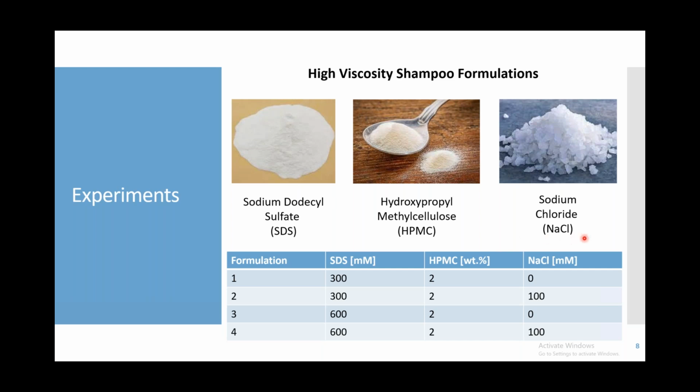The third ingredient shown here is salt. This is added to increase the viscosity in such a way that not too much surfactant SDS or other costly surfactant is used. So we made 4 formulations with different amounts of SDS and salt and 1 concentration of HPMC polymer.